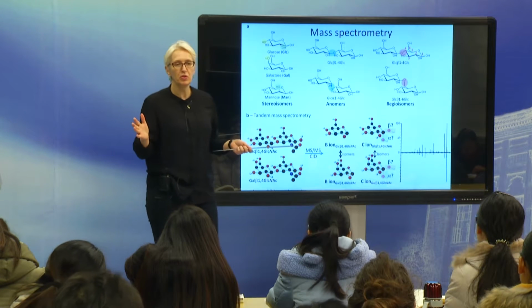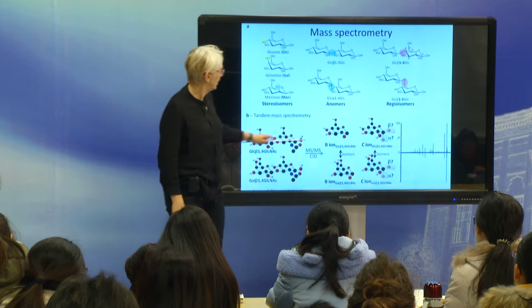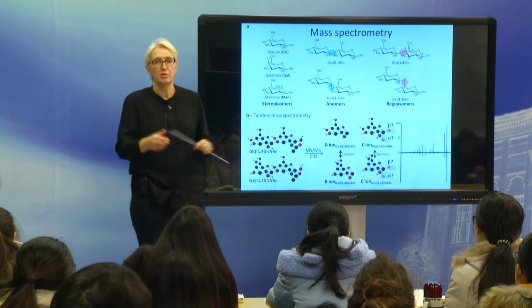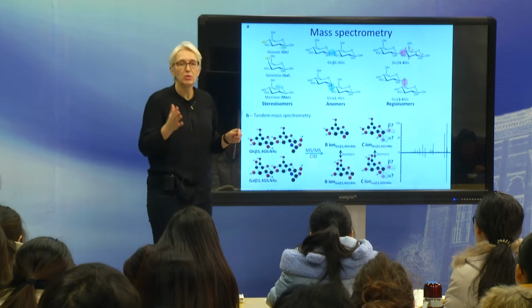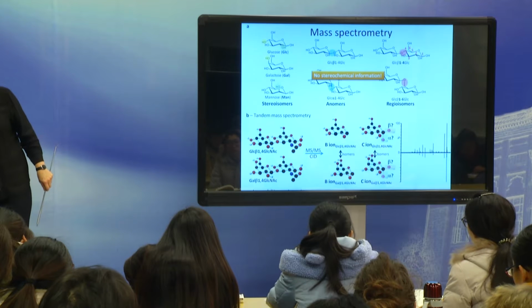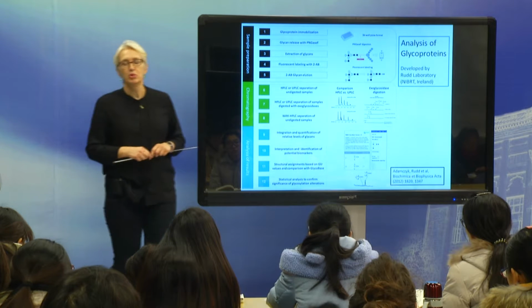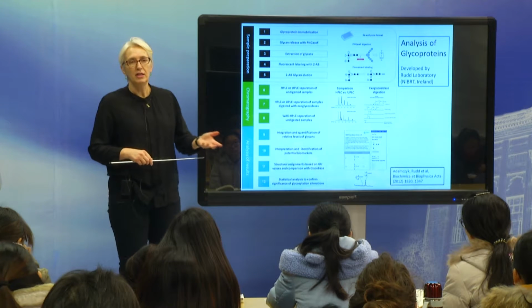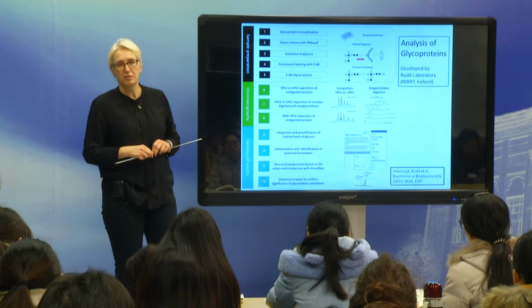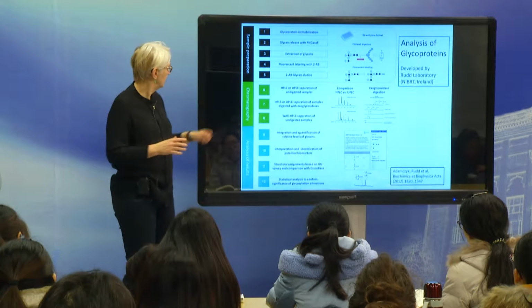So it's very useful for getting what I call two-dimensional structure. You have one of these hexoses, one of many. There are only a set number of hexoses you can have, but you don't really know which one. So how do you get more information out of this? There's no stereochemical information, so you need additional protocols in line with your mass spectrometry analysis. There's been a massive amount of work done, and these are very complicated protocols, and I'll go through this a little bit.